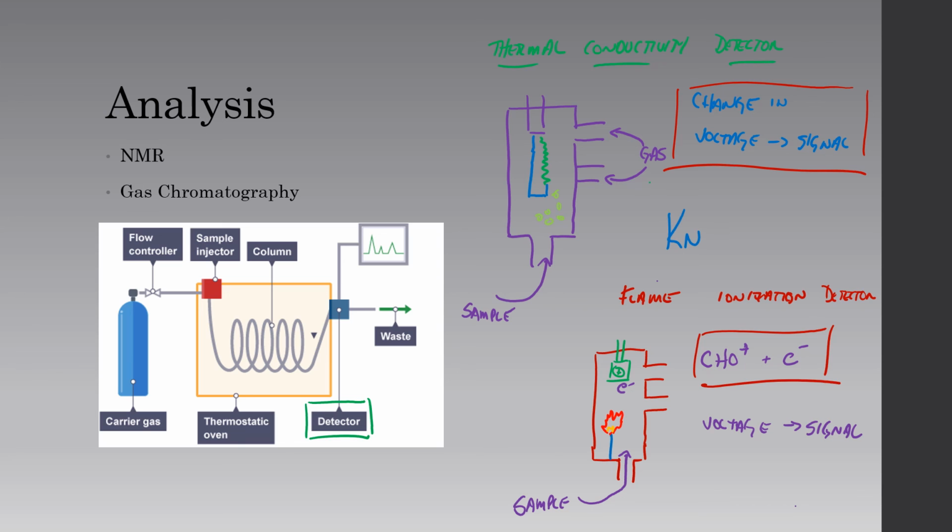We have to add a known sample into our compound mixture to see where they come out in our gas chromatogram. So what that means is we have to know a little bit about what we expect to get formed and add that through our gas chromatogram to see where it shows up. And then we can make a distinction between which compounds are coming out in our signals. And so our voltage gets converted to signals, and that's the last thing here that we see in light blue, right? We tend to see little spikes on a graph.